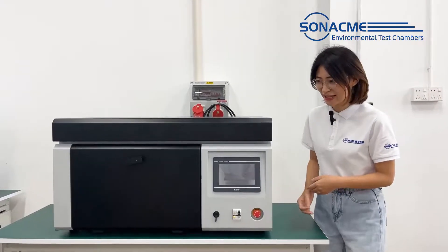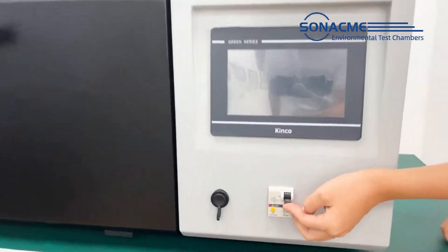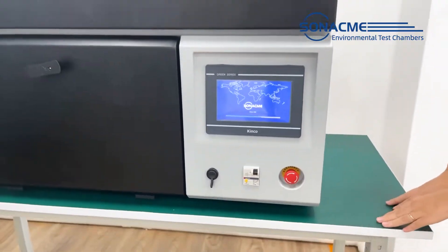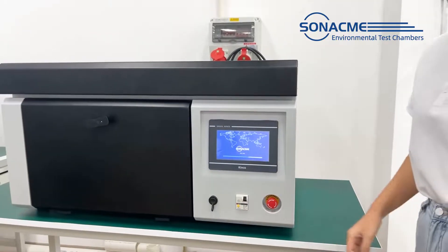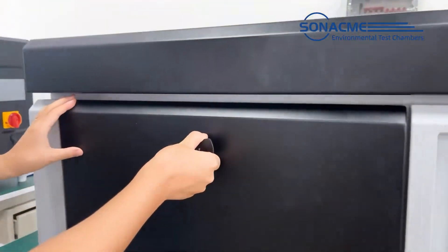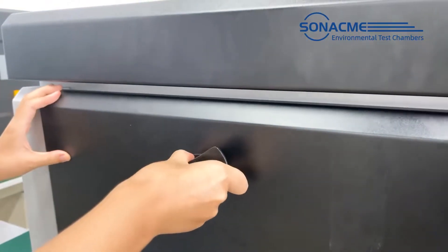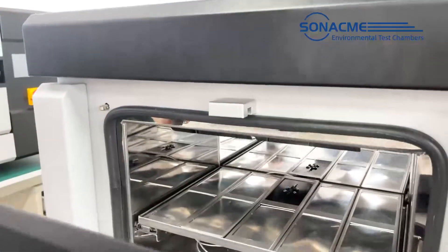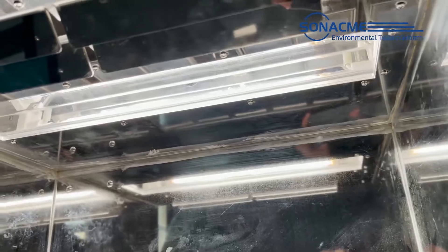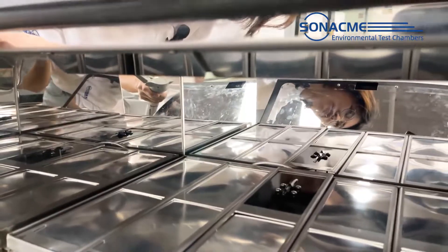Now we can start the machine. Power on switch. Let's see the test area — open the door. We can see the ZLAN lamp is on the top of the chamber. It is equipped with a 1.8 kW air-cooled ZLAN lamp.